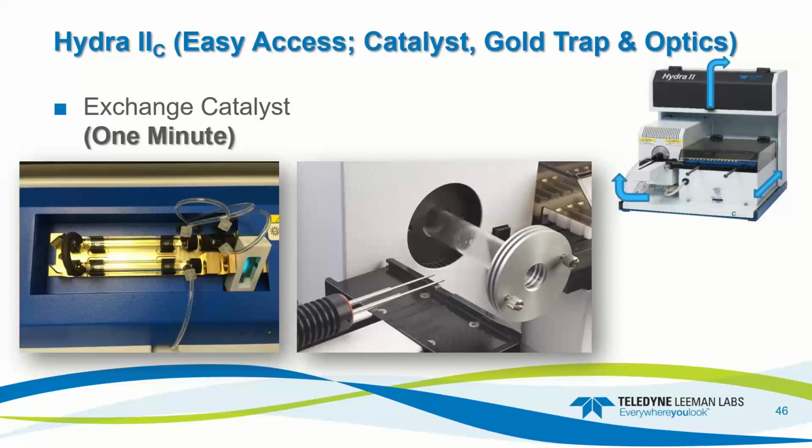And then our injector has one retaining thumb screw on the front, and if you release that, it will slide off to the left, and releasing two more thumb screws on your interface will get you to your catalyst tube. So it only takes about 1 minute to exchange a catalyst tube. It's very simple.